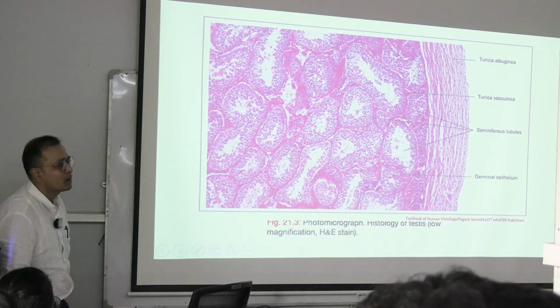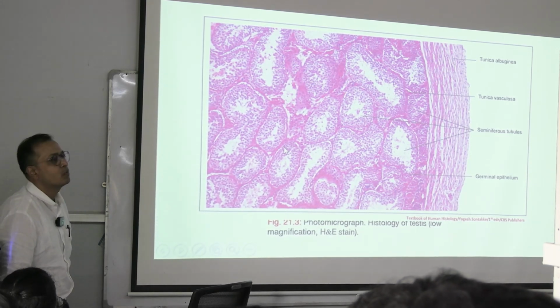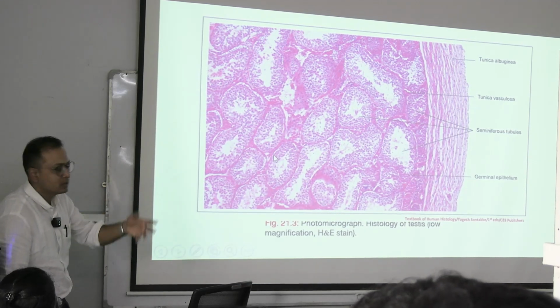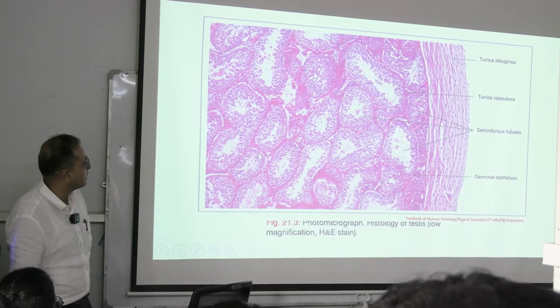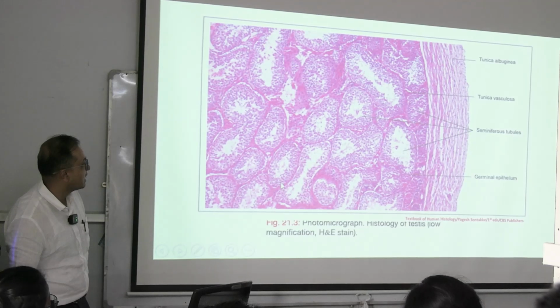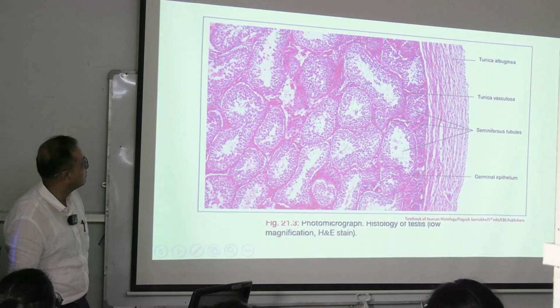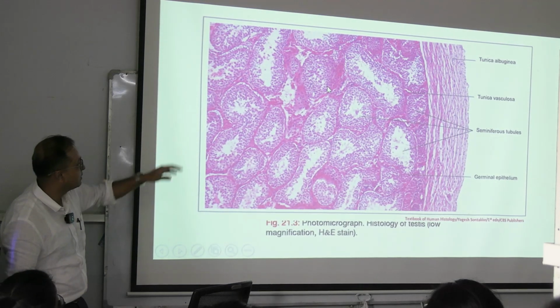Inside it, we have two kinds of cells present. One is Sertoli cells, which are the supporting cells. The second is the germ cells, which are the spermatocyte cells. Now, these are present inside the lumen. You see this boundary of the lumen, which is demarcated. This demarcated margin, we see inside the lumen. This is another lumen of this region, another seminiferous tubule. There are several of them, lying shoulder to shoulder in this region.